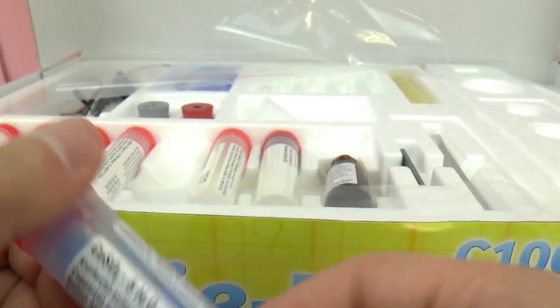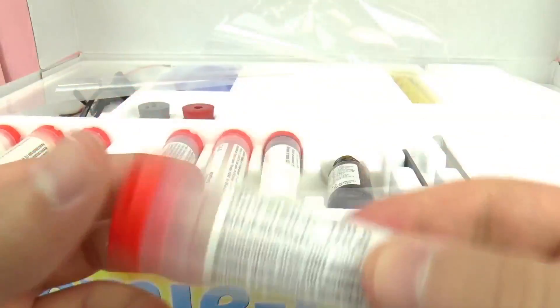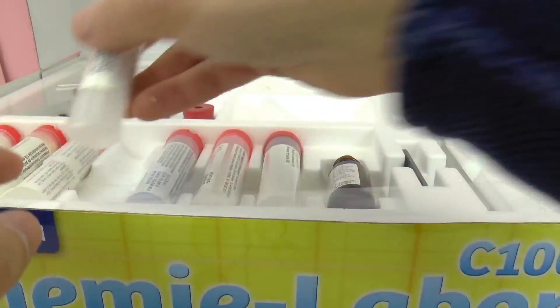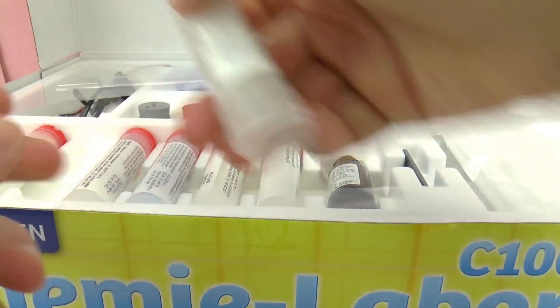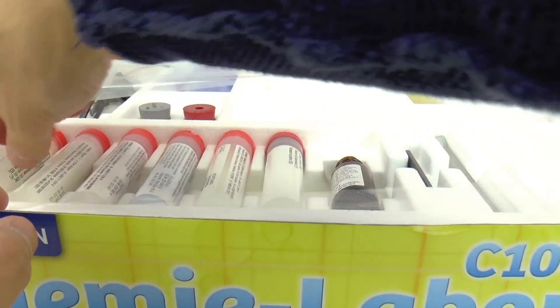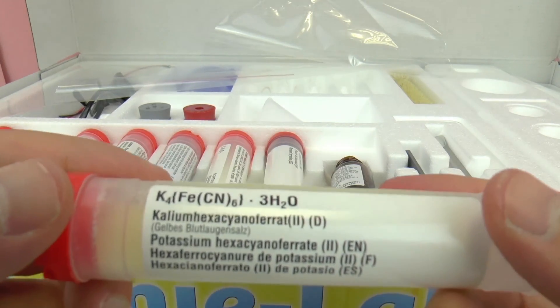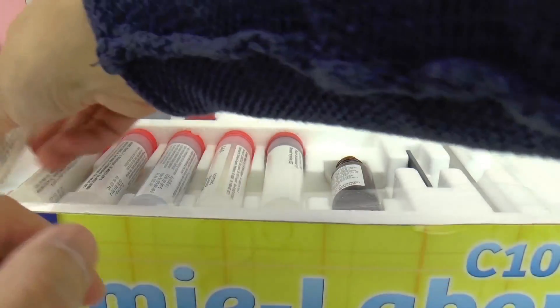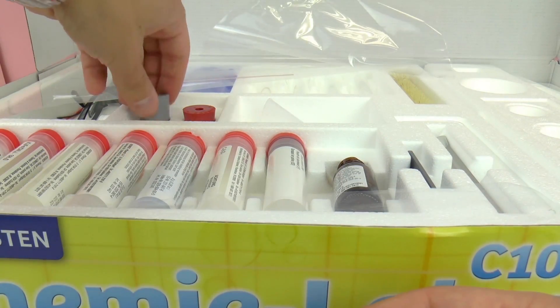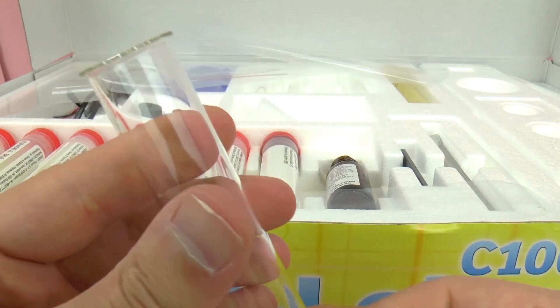Here we have copper sulfate — looks very interesting. Ammonium iron sulfate. So in the book all this is going to be explained and how to use everything. Calcium hydroxide. Here we have potassium — I'm not sure exactly what that one is, but like I said, the book will explain everything to us and how to safely use these chemicals.